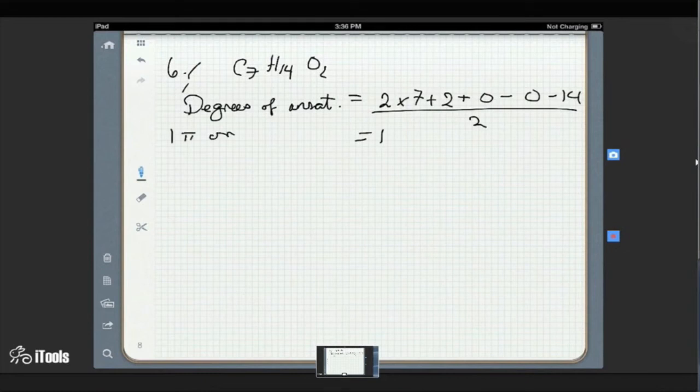Looks like we have an ether as well. I see a peak at 3,000, so that's probably just alkane and stuff. I don't think there's anything else in that. Well, yeah, there's a peak at 1714, that's carbonyl. Even methyl groups from the one on the far right, on the spectrum.